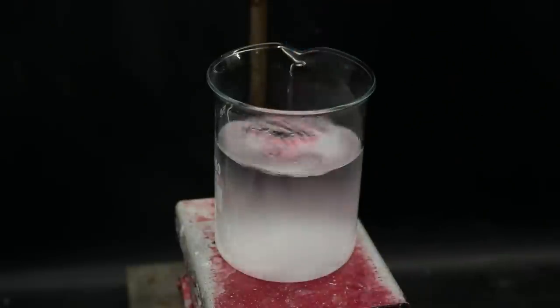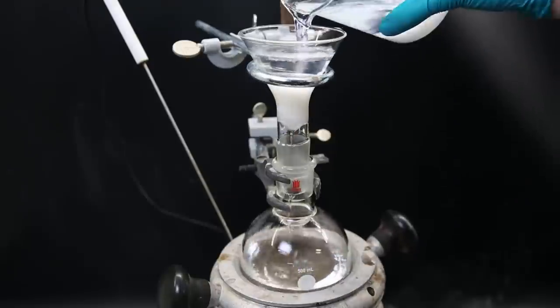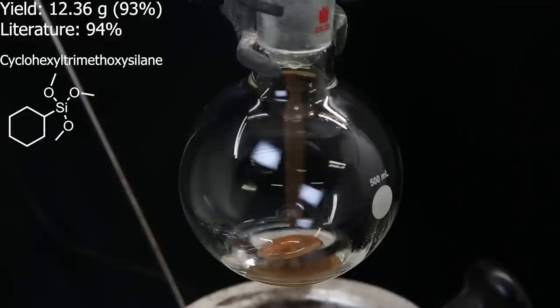sodium sulfate, which will hold onto most of the remaining water. I then filter it through some cotton, and set the filter up for short path vacuum distillation, to remove all of the pentane. When all of the pentane is gone, I am left with a clear liquid, which is cyclohexyltrimethoxysilane. The yield turned out to be 12.36 grams, or 93%, which is basically the same as the literature, even though I didn't do it in an inert atmosphere like them.